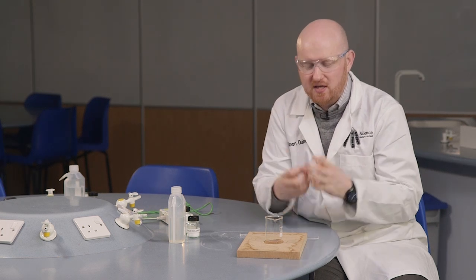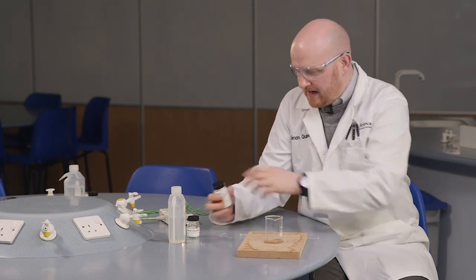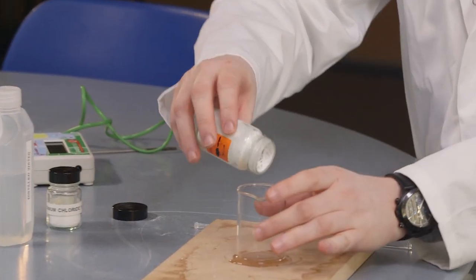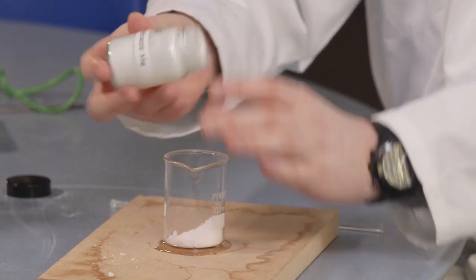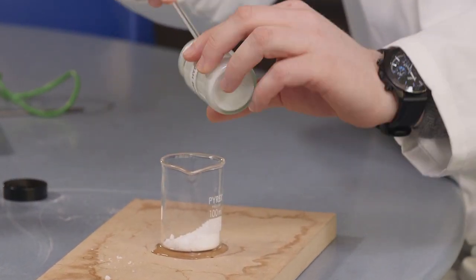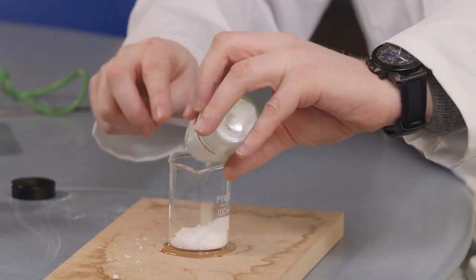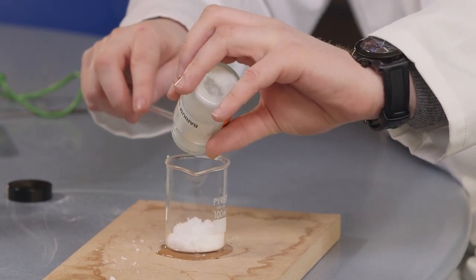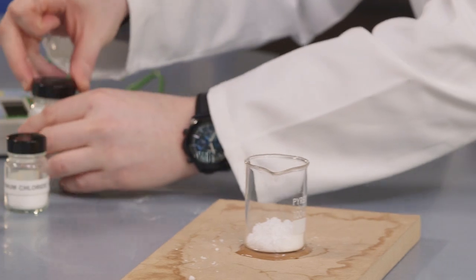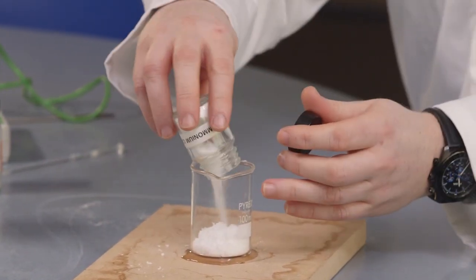So we're going to set the scene and get some ice going. So we have our beaker. I'm going to add our barium hydroxide to this beaker. Now this can be quite difficult to get out of the jar because it's quite lumpy. So I'm just going to use my glass rod. Like so. And then I'm going to add my ammonium chloride.